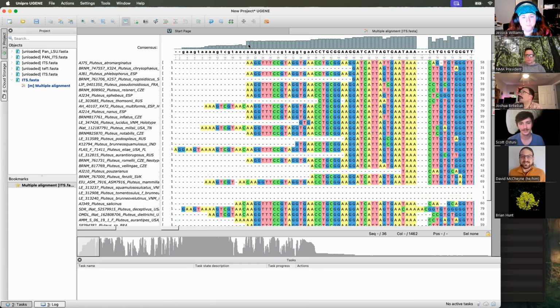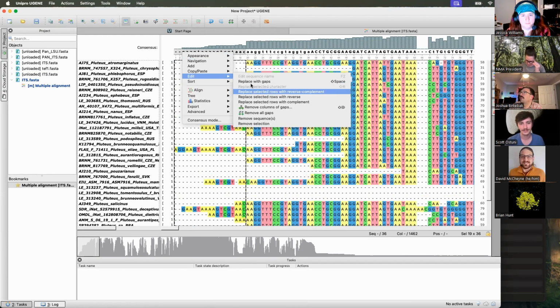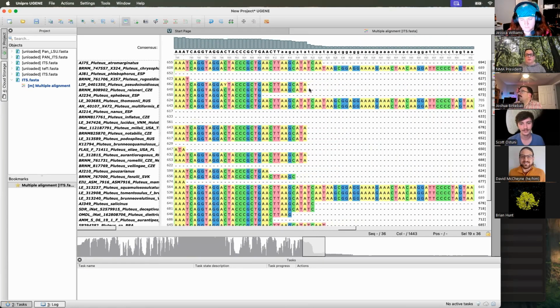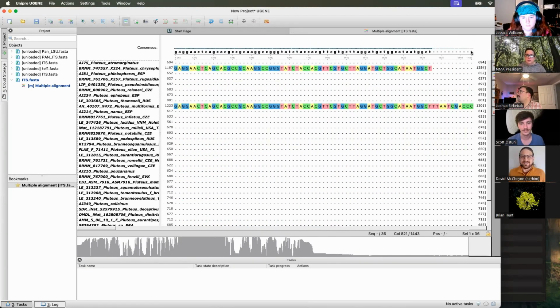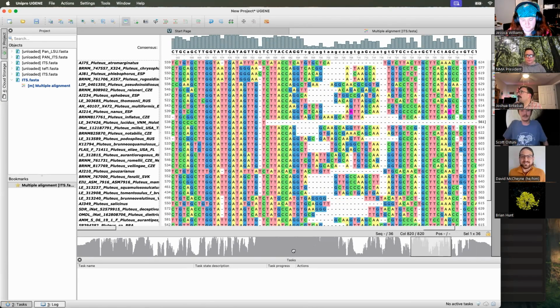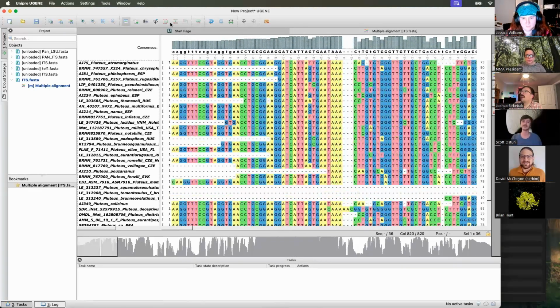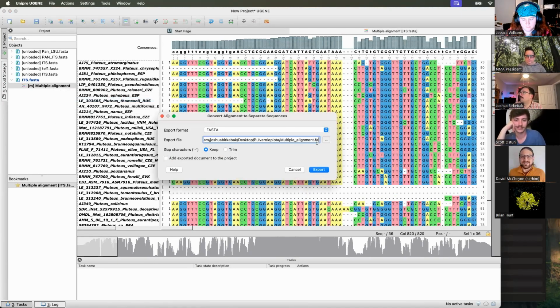Without getting in the weeds too much, I'm going to go ahead and trim this here. Trim the noise, and also just don't add a bunch of nucleotides to the tree for the software to have to handle when there's not a lot of information to be gained from all that extra stuff that only has a couple different representatives in it.